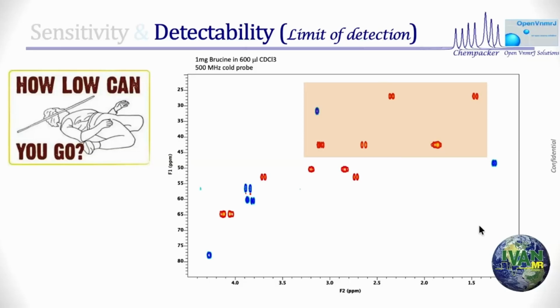sensitivity peaks, peak height peaks. They are the shortest peaks that there is. I said, what if I take that as an example? Not the methyl groups, not your aromatics. Let's take those methylenes.